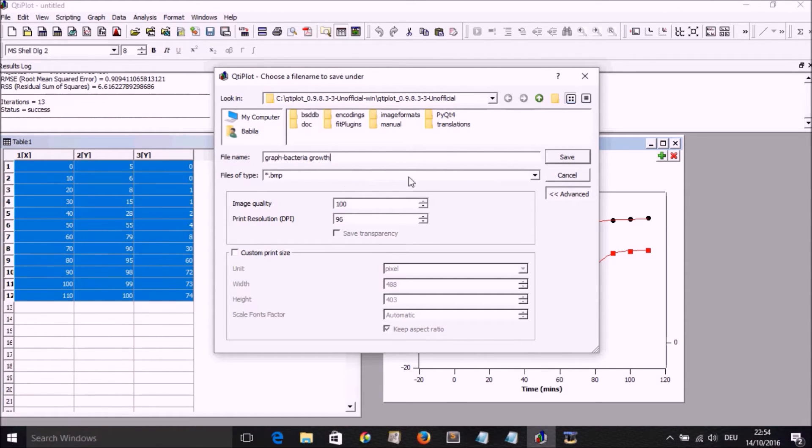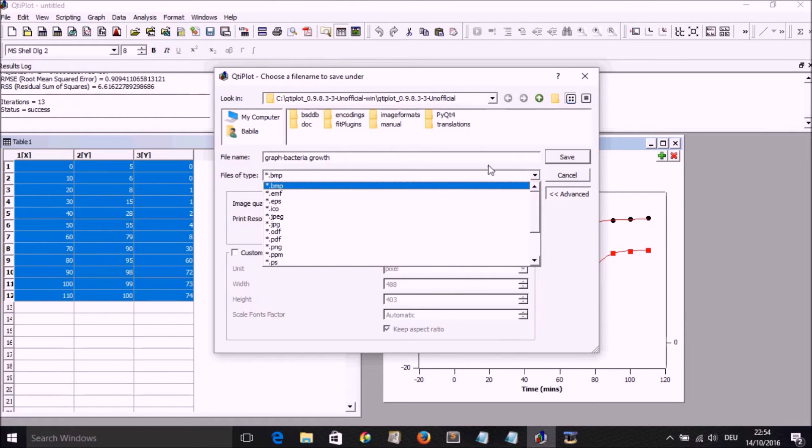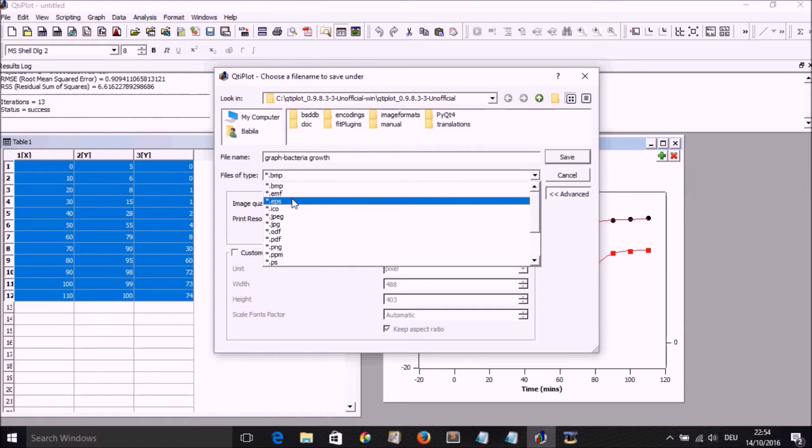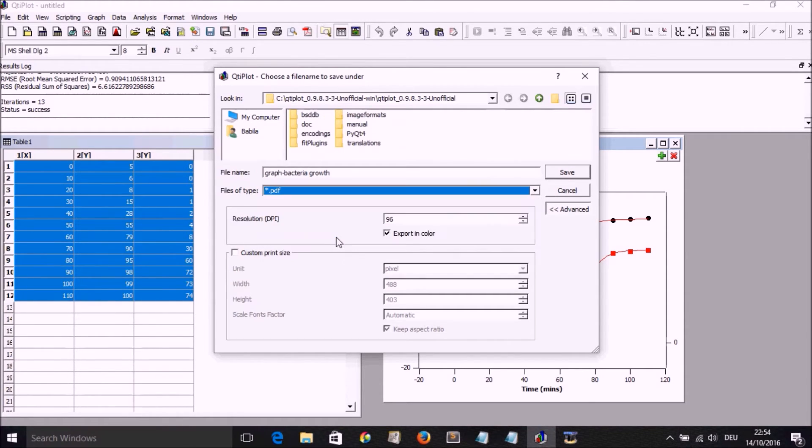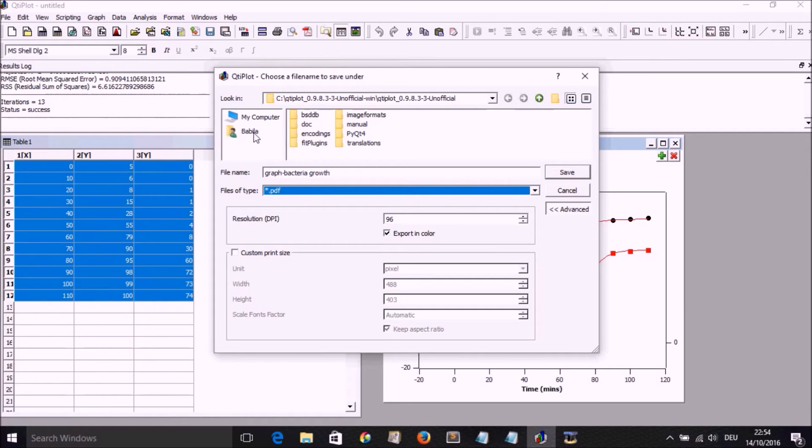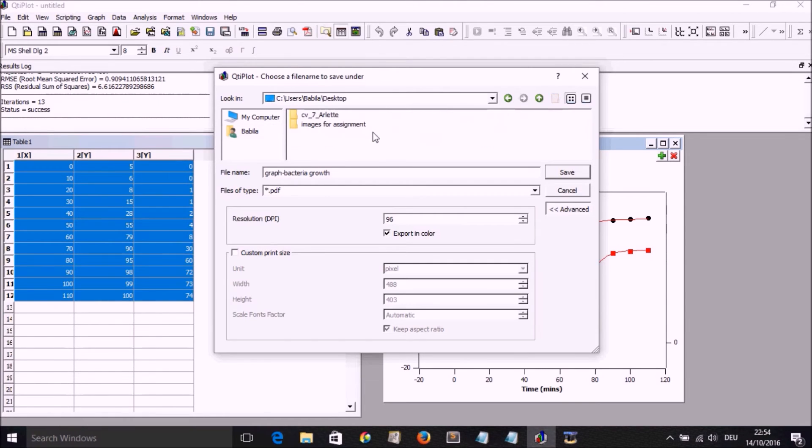And we change the type of plot from BMP to EMF or to PDF. Remember our videos about the different kind of files that can be used. We choose here, preferably, a vector file. And PDF is one of them, or EMF. So here we choose PDF and then we save it to our destination of preference.